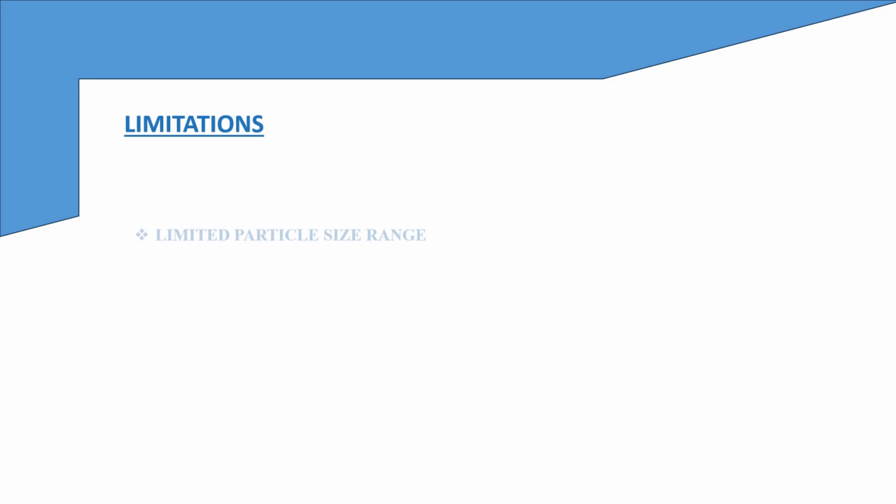The equipment has a limited particle size range. It works with particles ranging from only 0.3 nanometer up to 10 micrometers. It is ineffective for very large particles which may sediment, or for extremely small particles beyond its detection limit.